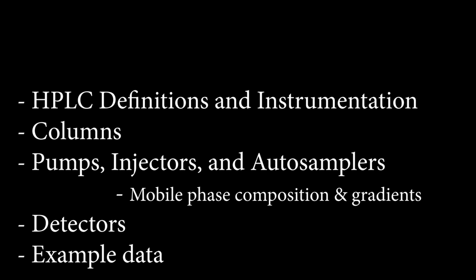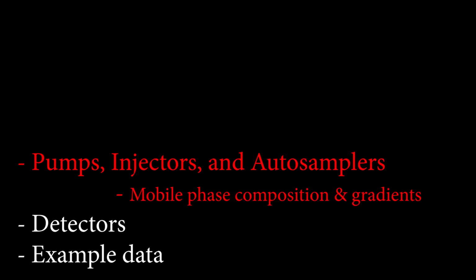Okay, so we went over some basic definitions. We talked about columns, a little bit about their chemistry and their length, inner diameter, and we talked about particle size. So now let's focus on a pretty nuts and bolts part of the instrument, and that is the pumps. You've heard me talk a lot about pressure.